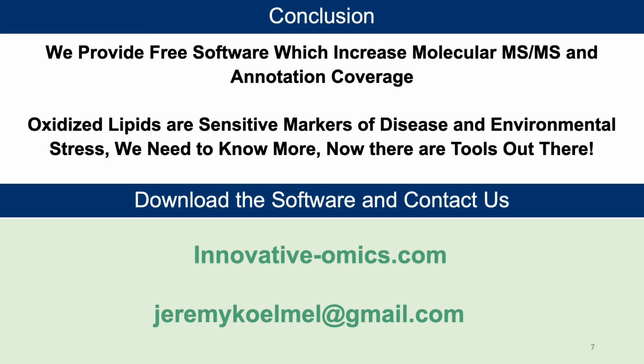And so that summarizes the talk. I'd like to note here that we provide free software which increases molecular MSMS and annotation coverage at innovativeomics.com. Quite a diverse range of software for lipidomics and environmental analyses.